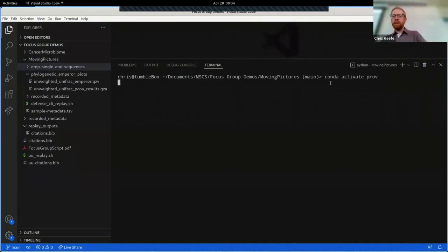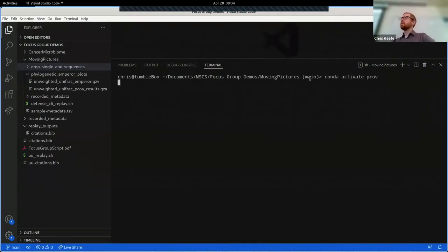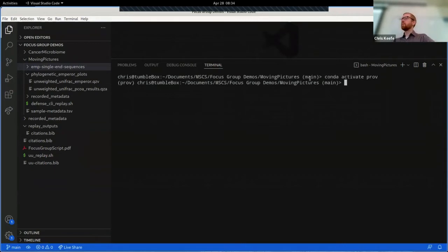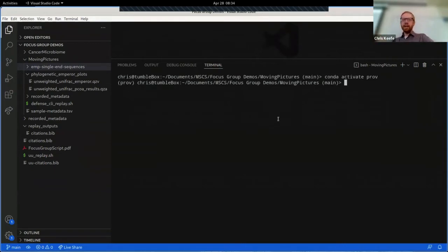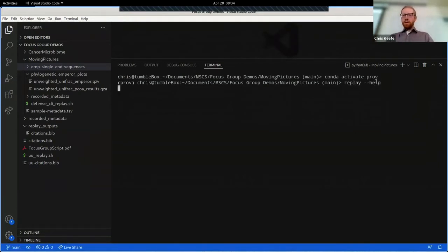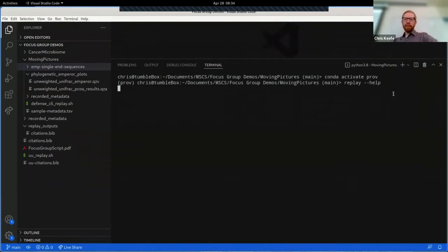I'm going to begin by activating a conda environment, which is kind of a safe environment on your computer that lets you run software without dependency conflicts with other software. This thing will give us access to provenance replay.